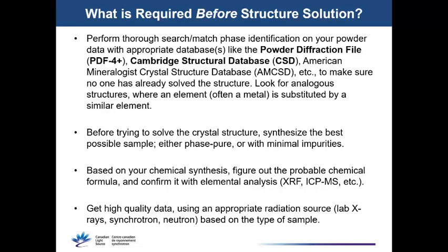You always want to make sure you have the best sample possible, particularly with respect to purity. You can save a lot of time in the long run by getting a very pure, high-quality sample than trying to deal with a sample with impurities, and it just creates a great degree of uncertainty.